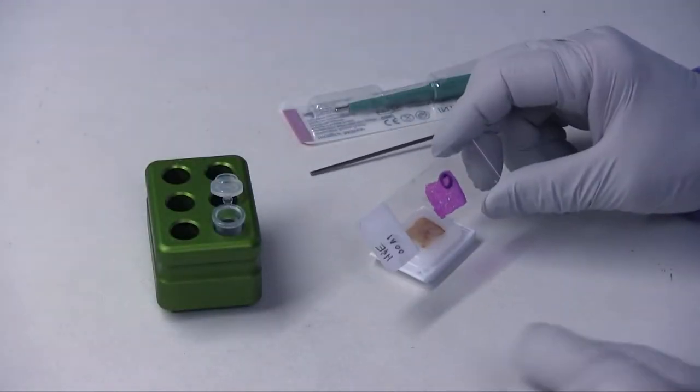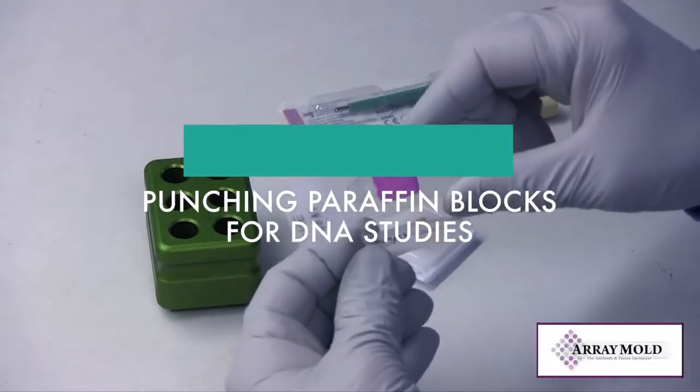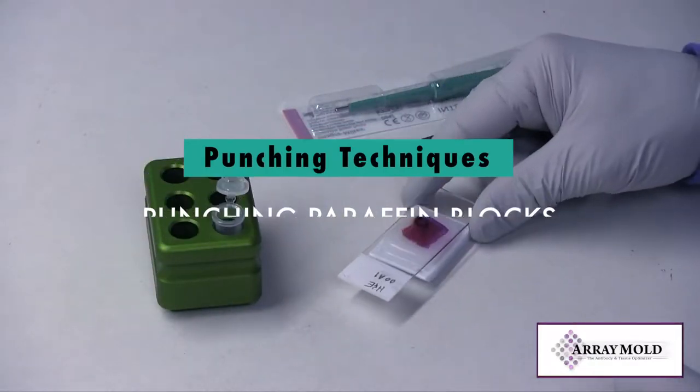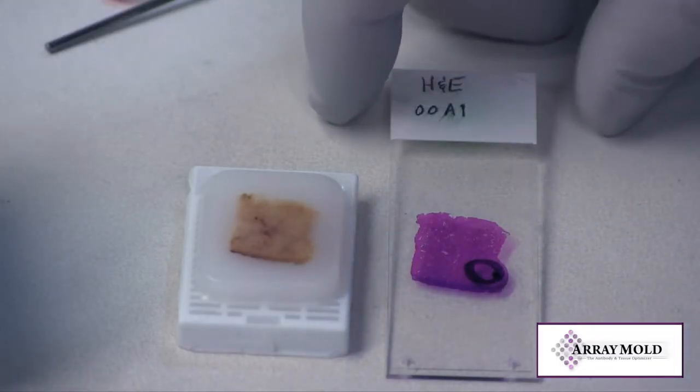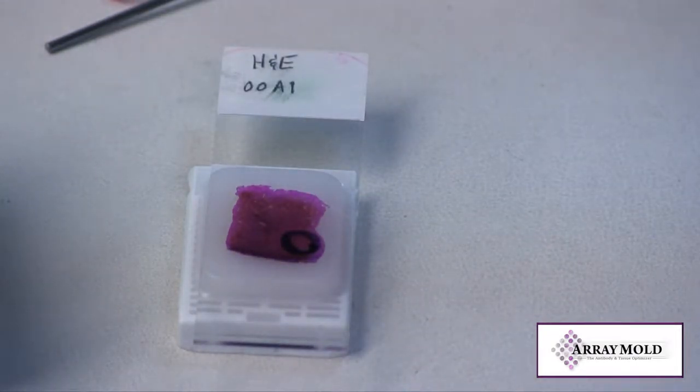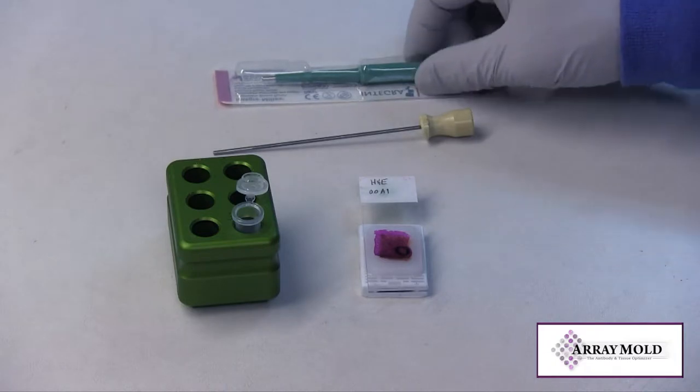First of all, I like to double check my labeling. It's easy to mix up tubes, so always check yourself. Match the block to the slide. If they don't match because the block has been trimmed into a lot, you may have to recut the block to get a more accurate slide from it.